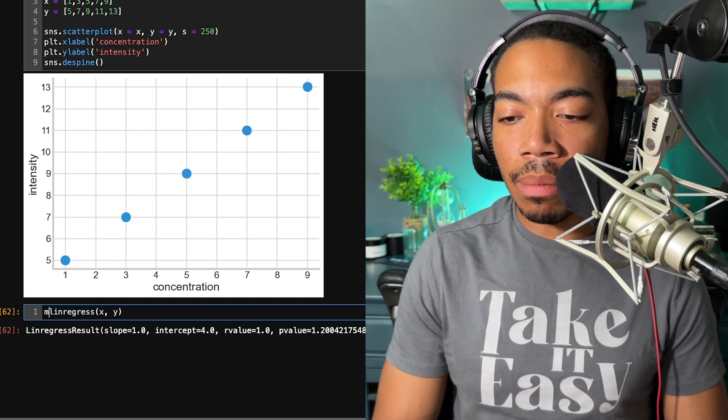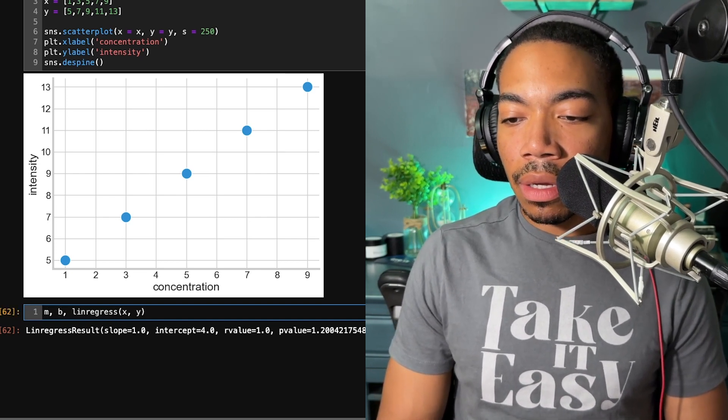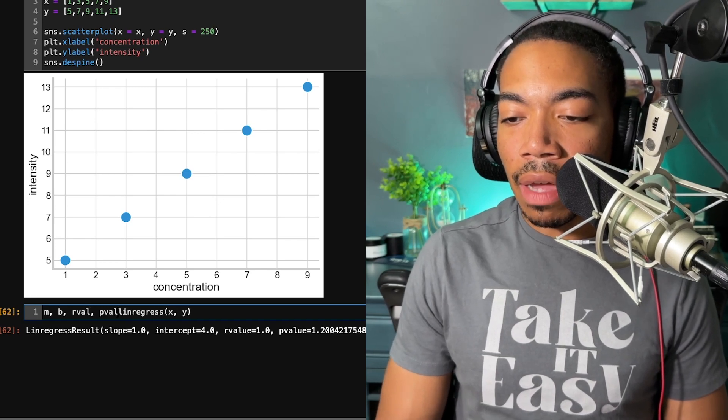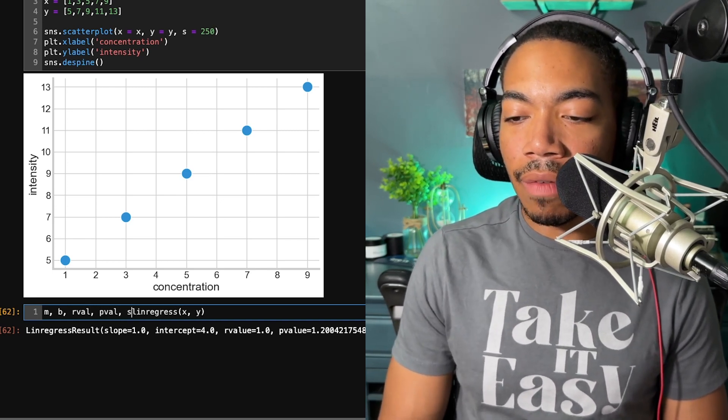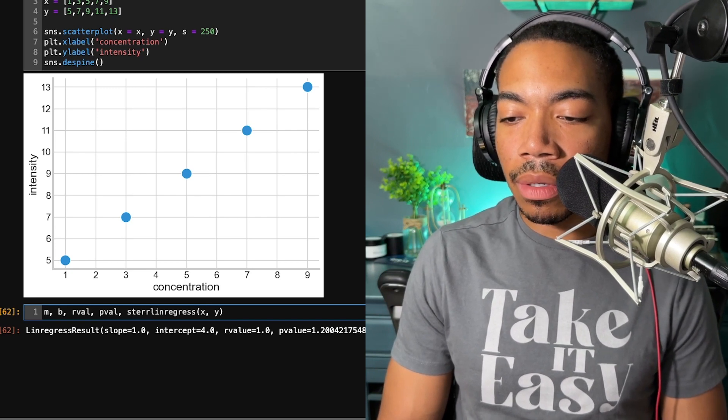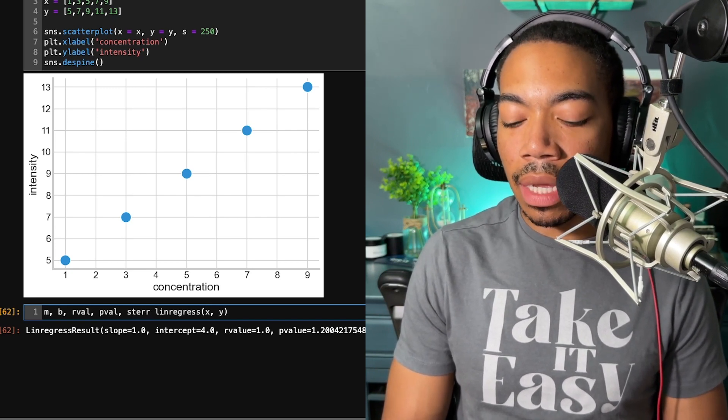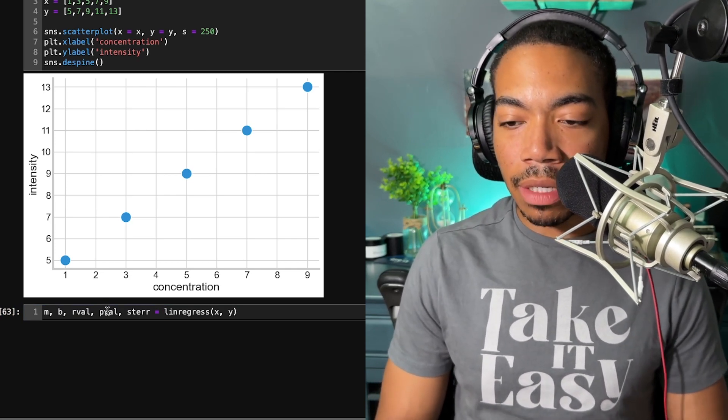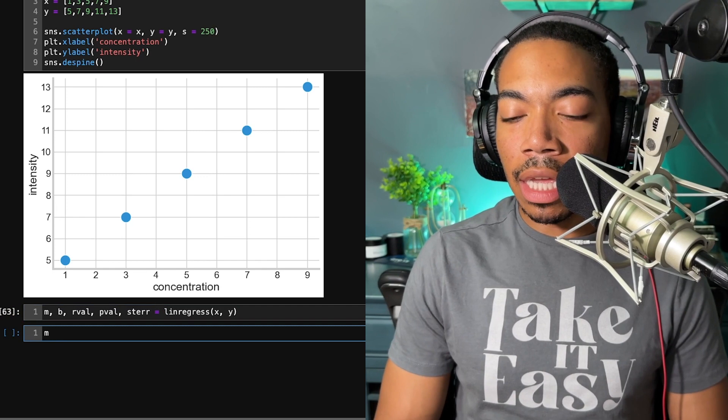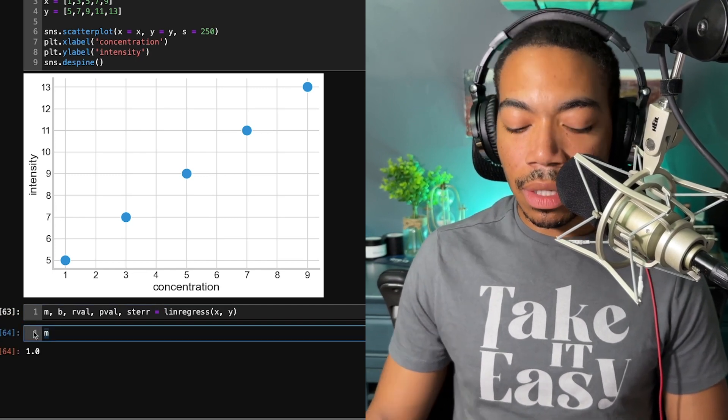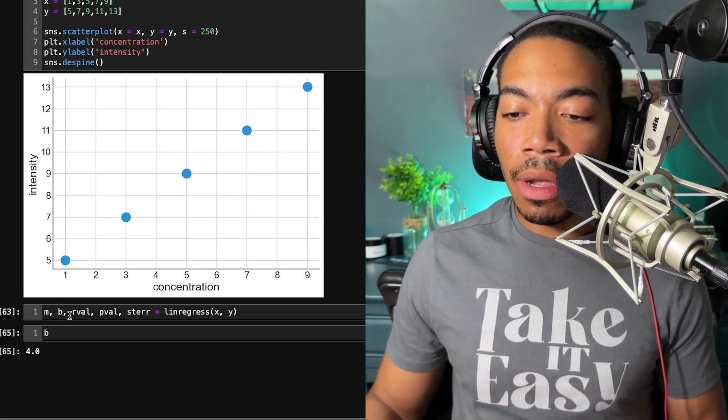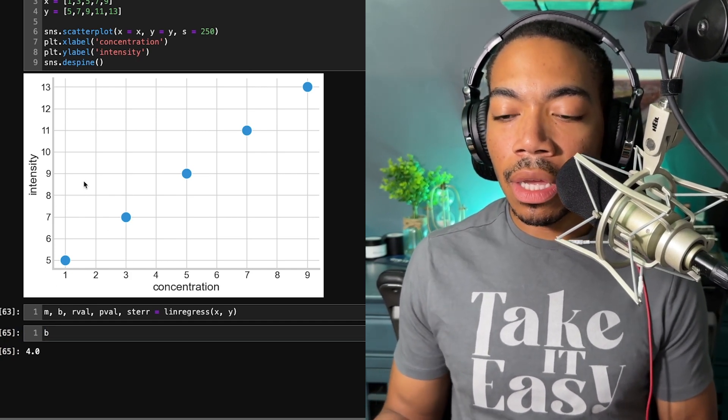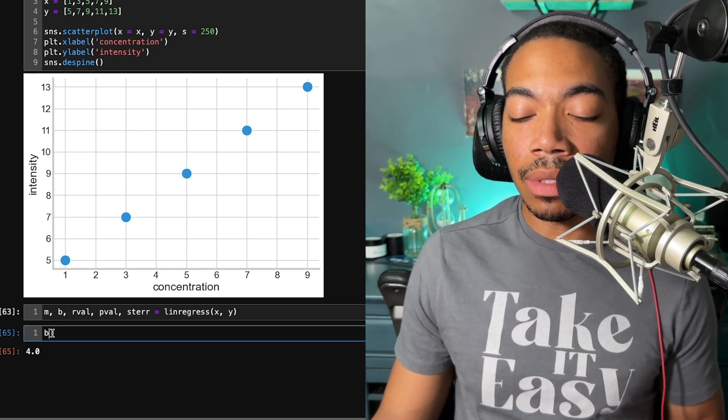So slope will be stored as m, the intercept will be stored as b, r value for the r value, p value for the p value, and then we'll have a standard error term that we will store as such. Now, all those parameters are stored in their respective values. If you look at m, you see that it's 1. If you look at b, you see that we have that 4 value. And so now we have our model parameters that we can then begin to use to estimate the concentration from another sample.